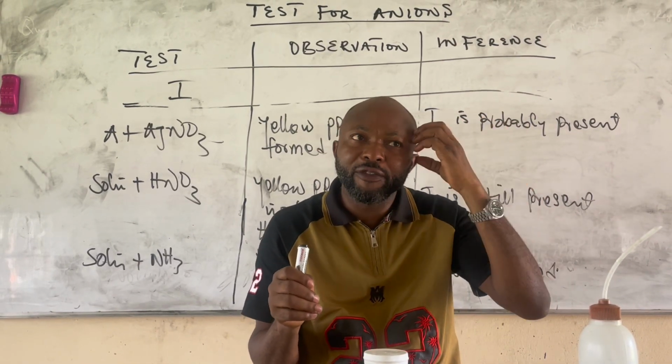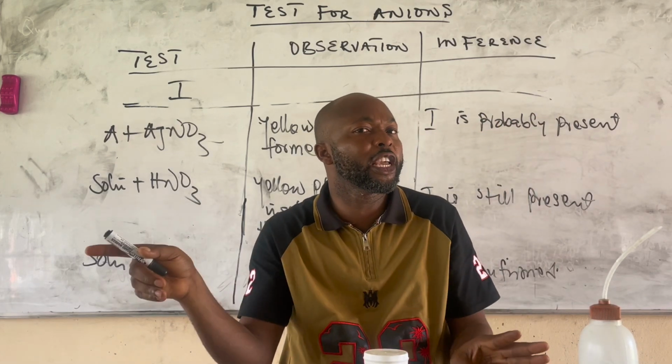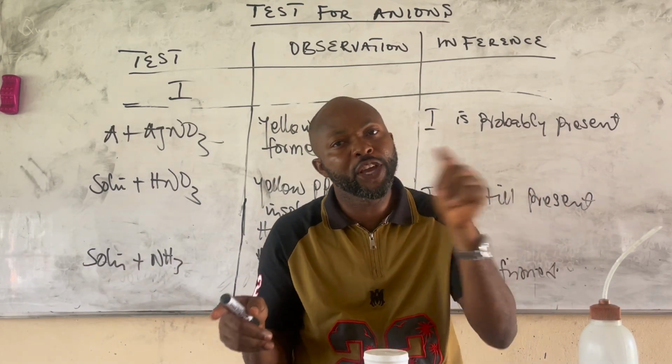Now, that is my first impression that comes to mind. But if it is not chlorine, you have to look at the word inference. Is chlorine there? If it is not there, you see bromine, then you know that it is not white precipitate, it is pale yellow precipitate.